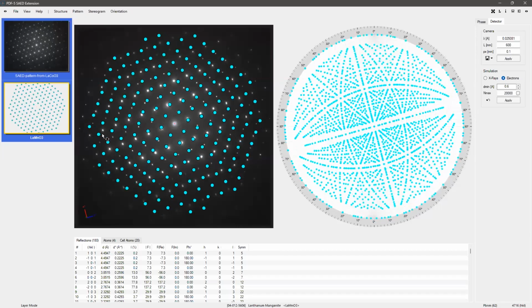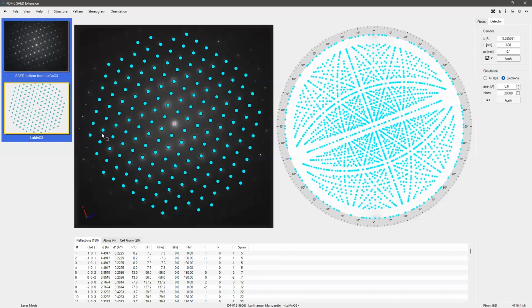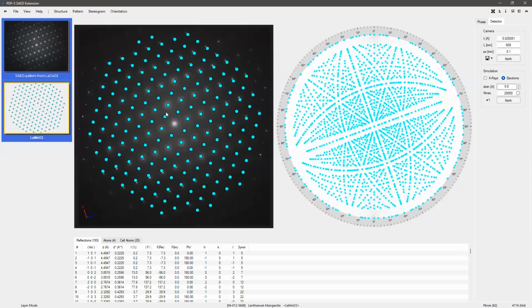And with the control key and mouse wheel, it will rotate by 0.1 degree. So we use this for multiple functions. Control or shift or alt key, control key will be used for fine tuning, and the shift key for larger steps. Whereas without any of these keys, the mouse wheel will use the default steps by 1 degree, for example.